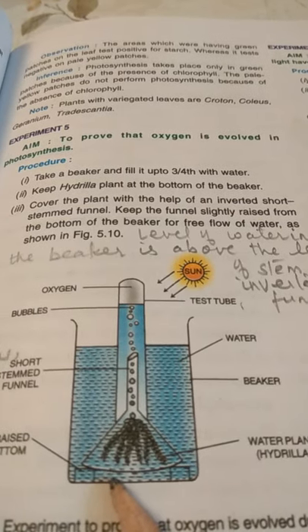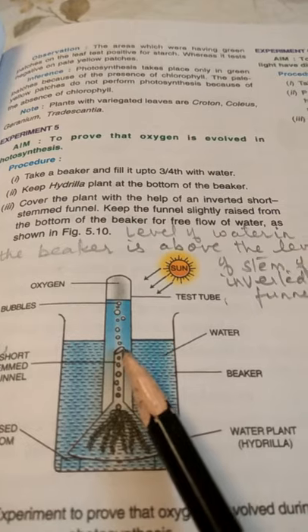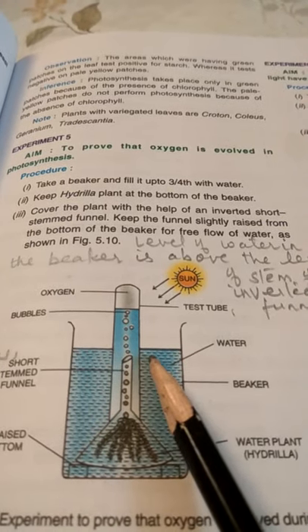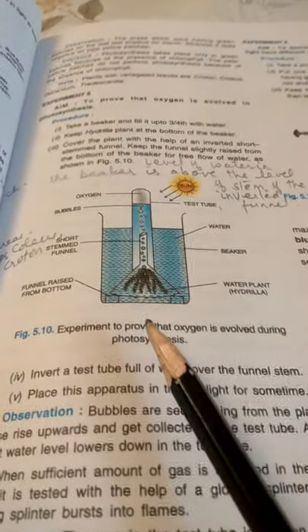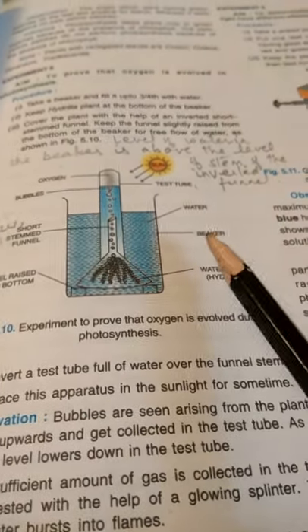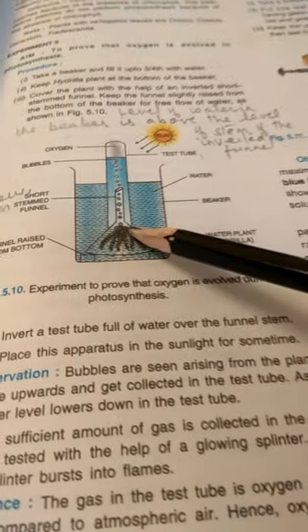We will cover the plant with an inverted short-stemmed funnel so that the water level in the beaker is above the level of the stem of the funnel. Then we will invert a test tube filled with water over the funnel stem.